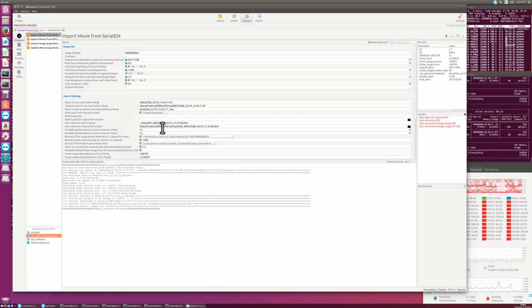So we had an installation where we had to take the numbers in the TIFF file and divide it by 12, and then we ended up with a floating point file that had floating point values that were corresponding to the electron dose that SerialEM or the K2 camera was seeing. And what you want is the dose before the sample, not after the sample, so you can deal with this here. And there's different options. You can also define the dose manually, by just saying, I know what my dose is, it's 1 electron per pixel or something per frame, and then you can type it here.